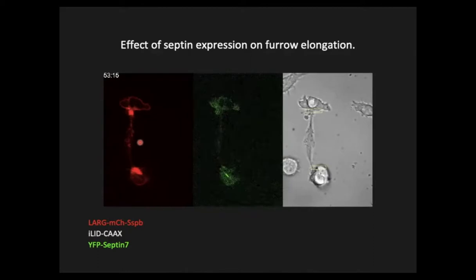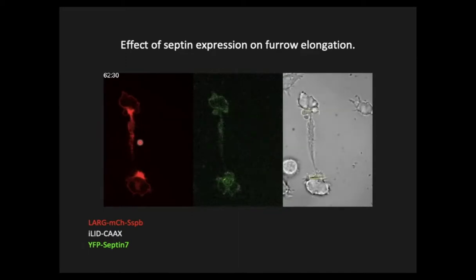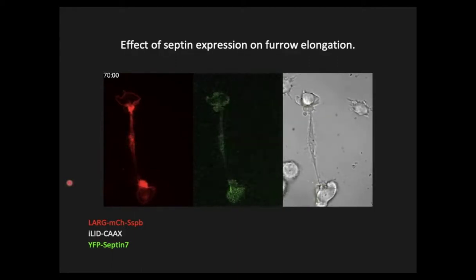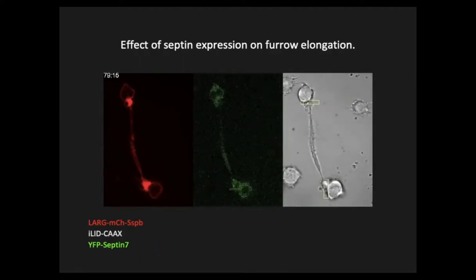And also we keep photoactivating, as you will see. If we keep photoactivating, we found that these cells form a structure similar to the mid-body.